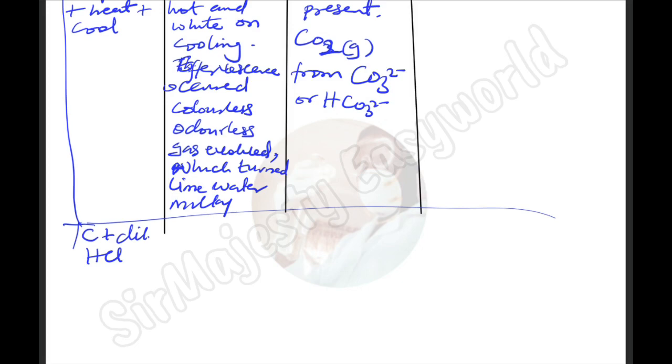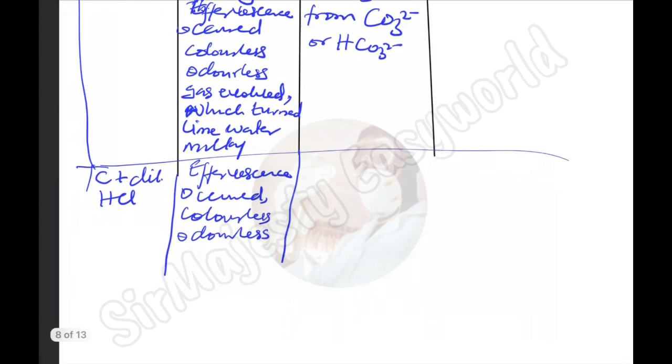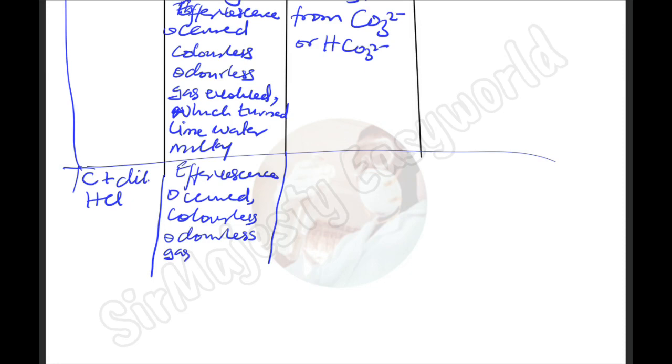So now what will happen, you just say effervescence occurred, colorless, odorless gas evolved, just like we reported exactly up there, which turned lime water milky.